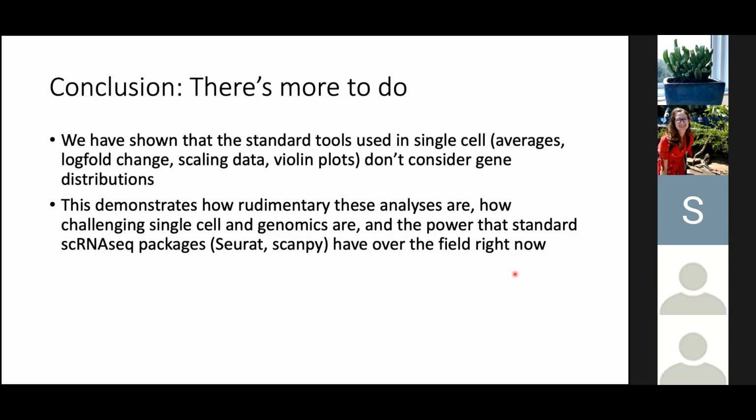Now you're asking me where it comes from. Again, I have no idea. My guess, frankly, comes down to sensitivity. I would imagine that we just can't pick up that few transcripts when we're doing our sequencing. That would be my guess.